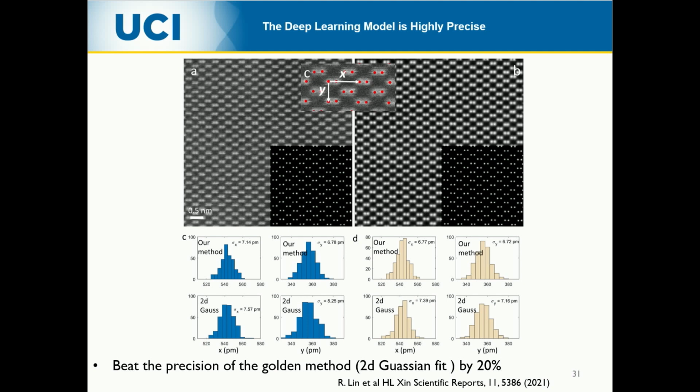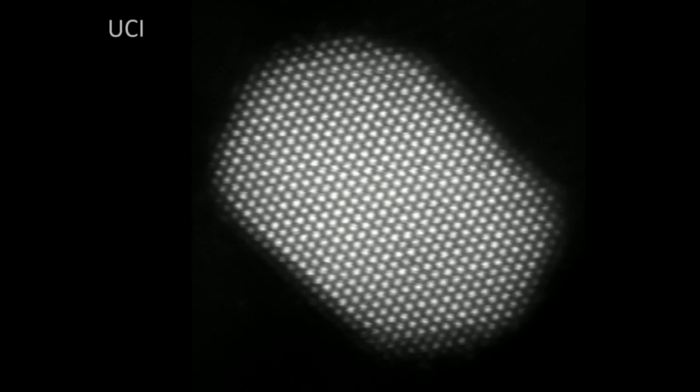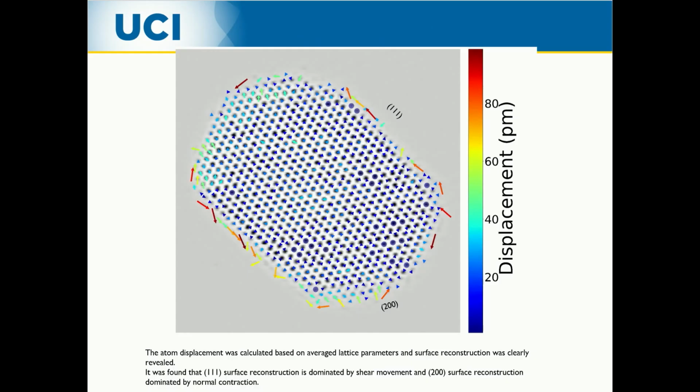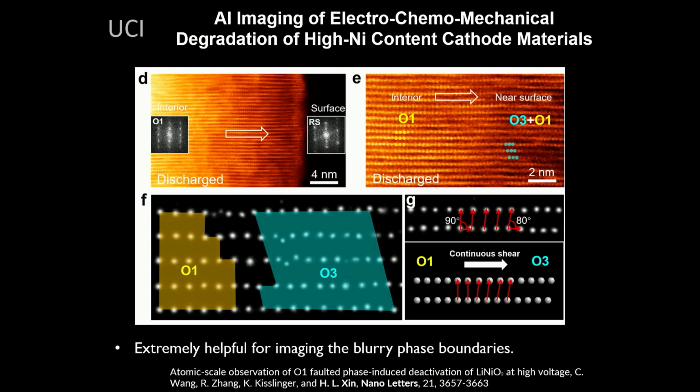Here we're using, Paul, the validation method your group created, the silicon dumbbell. And we're able to show that, I'm sorry, I beat your method by 20%. Hopefully everyone can try this and show me that it does. Since it's so precise, you can use it to extract strain.